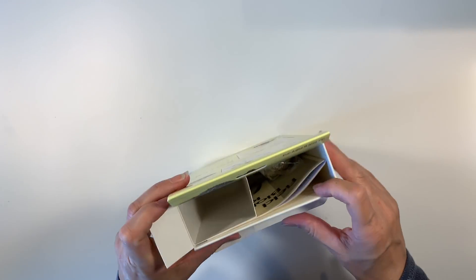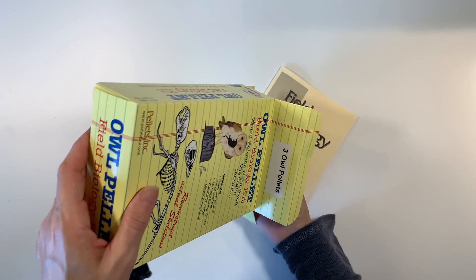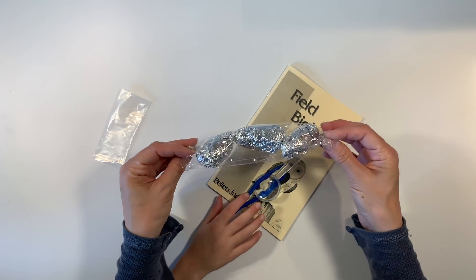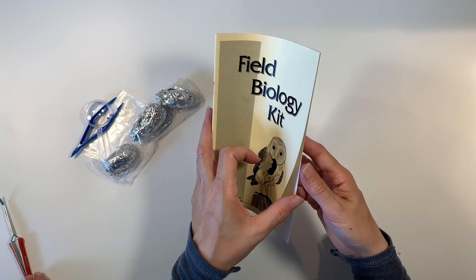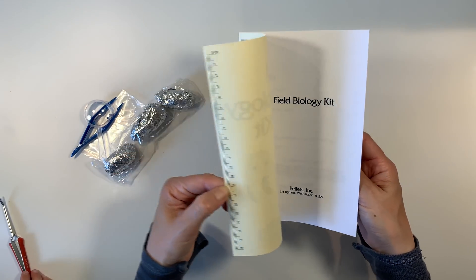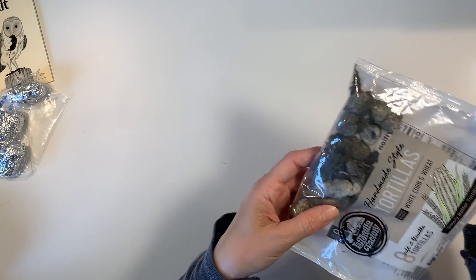So first I'm going to share with you what comes in this kit. This kit comes with tweezers, a magnifying glass, and a field guide which turned out to be incredibly helpful, as well as three large owl pellets.